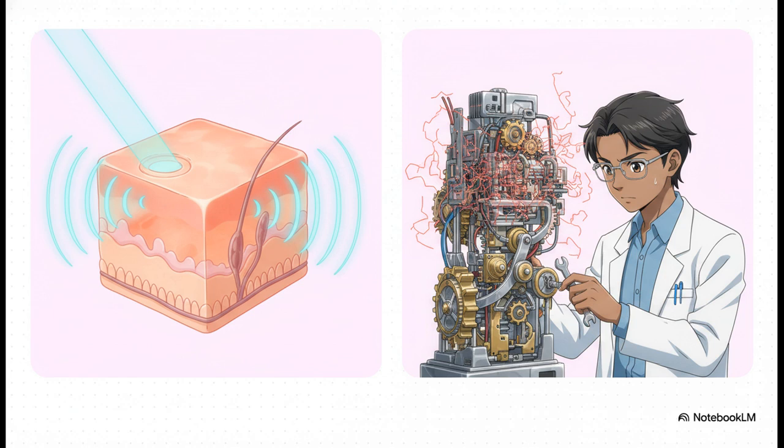The limitations really come down to the hardware. These instruments are incredibly complex. Because we're literally measuring microscopic sounds, the system is hypersensitive to any ambient acoustic noise in the room. That means you need massive vibration isolation and incredibly strict, meticulous calibration to get reliable data.